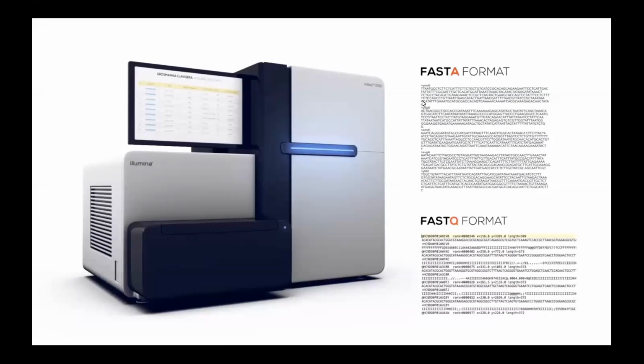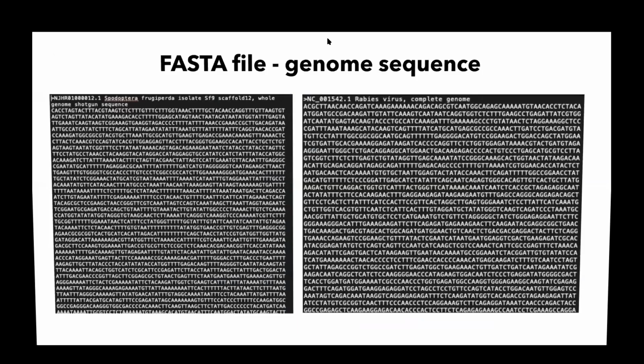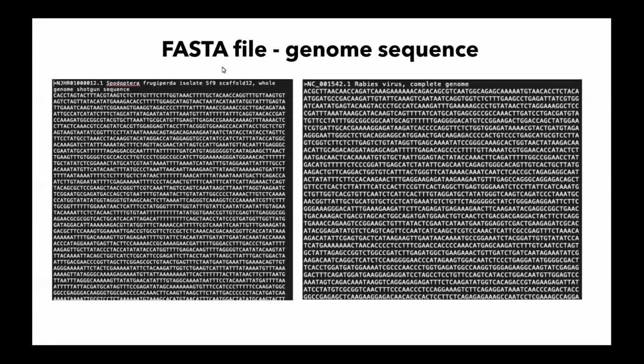They are assembled in longer reads. So here you can see reads, and sometimes you can also see whole chromosomes assembled in a file that looks like this. So what are some uses for the FASTA files? The FASTA files are files that a lot of times are used for full genome. So here you can see a couple of full genomes.